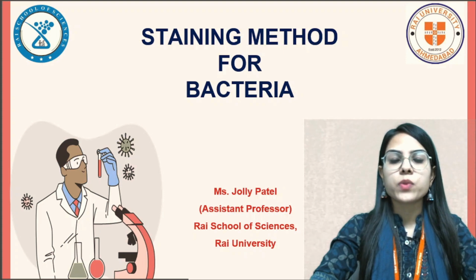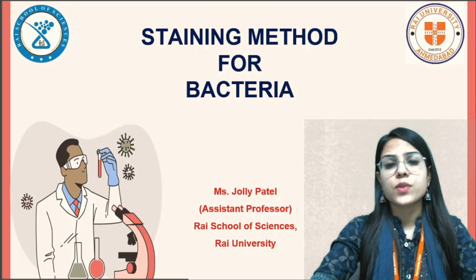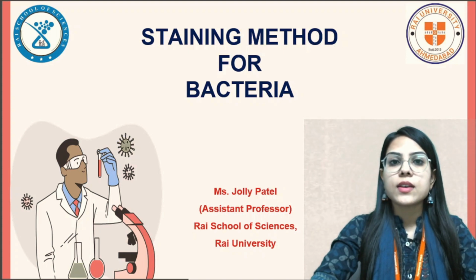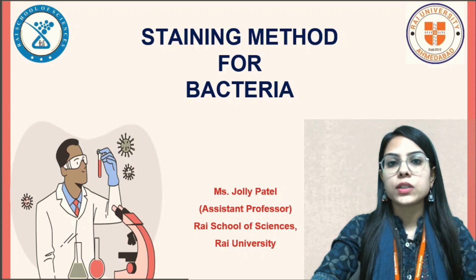Today we will discuss a staining method for bacteria. So why are we learning this topic and what is its importance? As we know, bacteria are very small in size and, secondly, bacteria are colorless. So for visualization of bacteria, we require two things: first, the use of a microscope, and second, a proper color contrast.